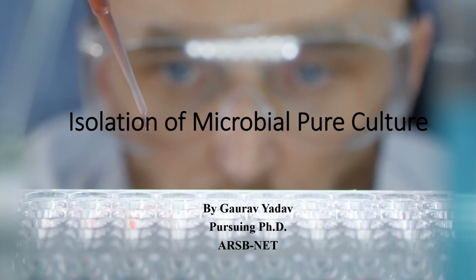So today's topic of discussion is isolation of microbial pure culture.